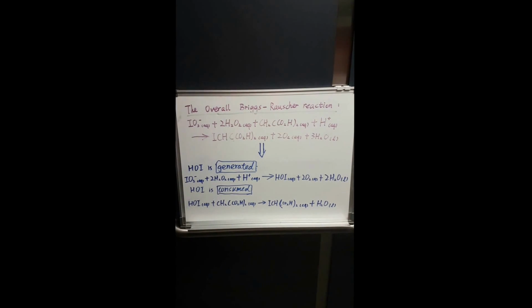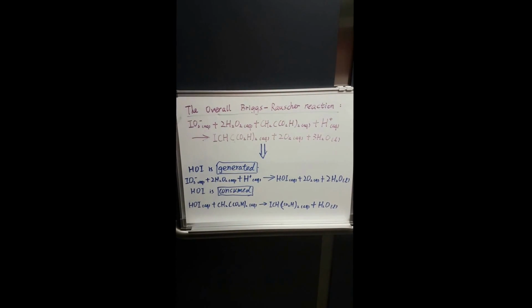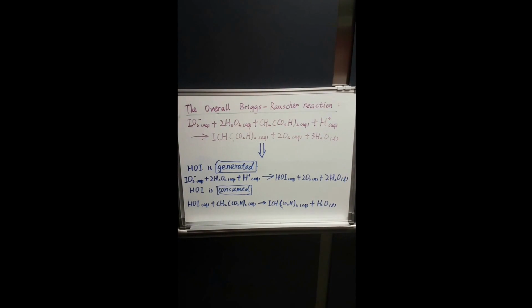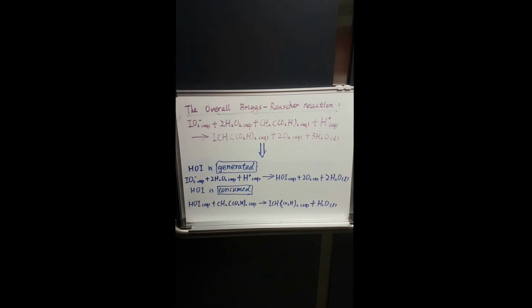The dark blue starch-iodine complex consists of amylose and iodine. The color of the complex, blue-black, comes from the pentaiodide anion, I5-, formed when the I2 and I- concentrations are elevated. Though normally an unstable anion, I5- becomes stable as part of the starch complex.